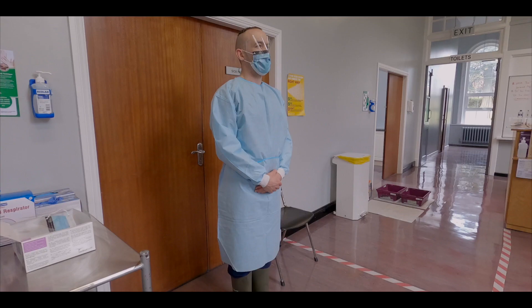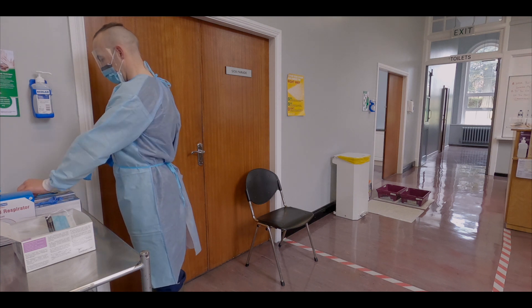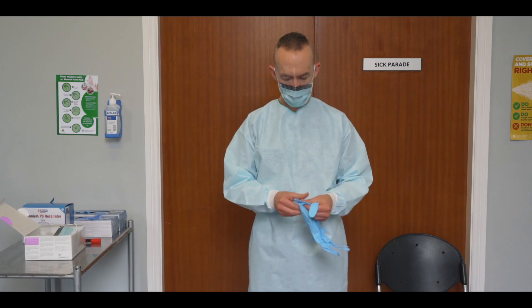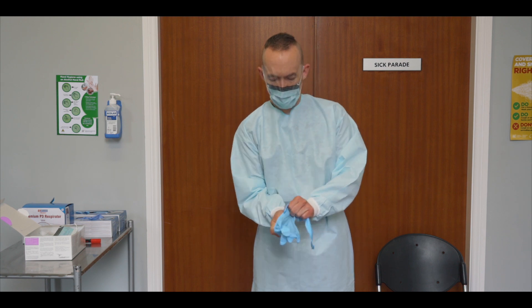Choose an appropriate sized pair of long cuff nitrile gloves and inspect them for any holes, tears or defects. Don each glove being careful to ensure that the cuff of each glove covers the cuff of the gown on both sides.